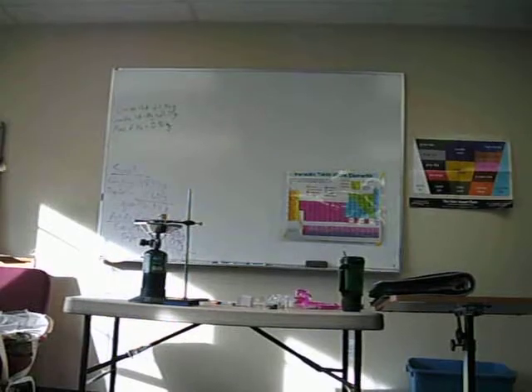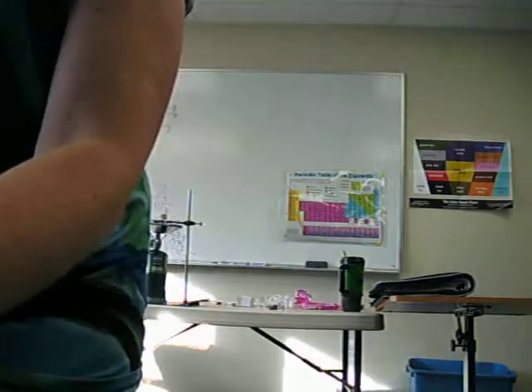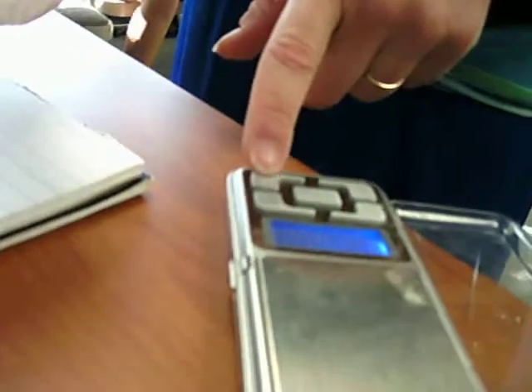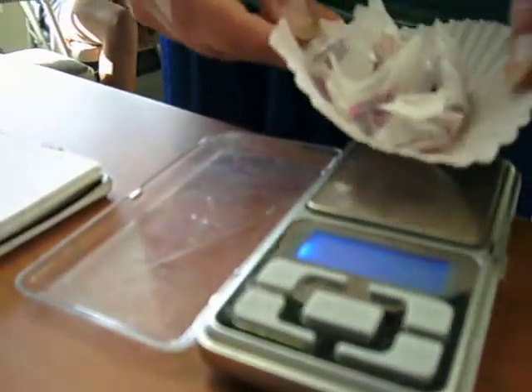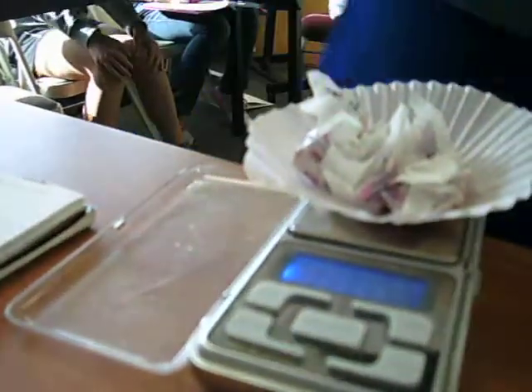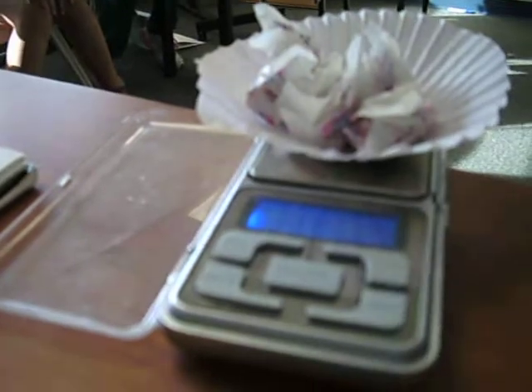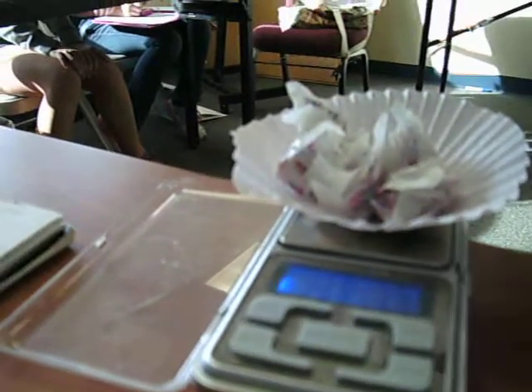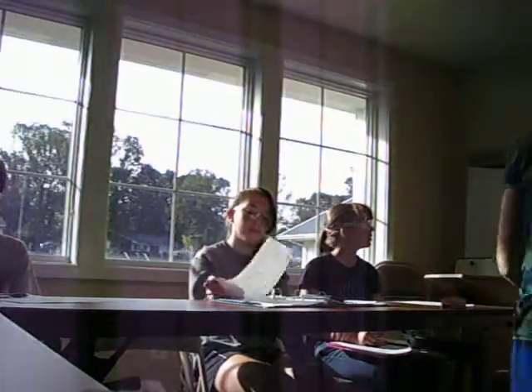And we know how much our papers all weigh, so we can find the new mass of the gum. So here, aim the camera. Okay, so it's tared to 0. And what do we get? So the sugar gum now has a mass of 14.89 grams.